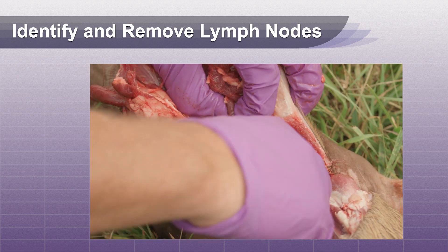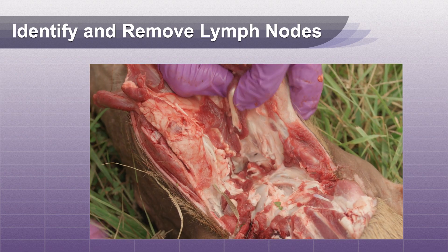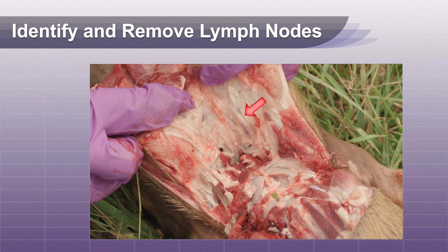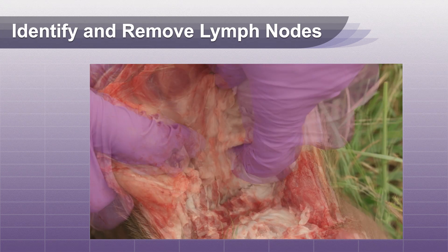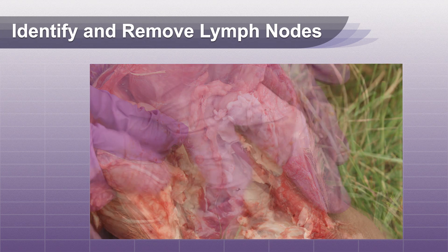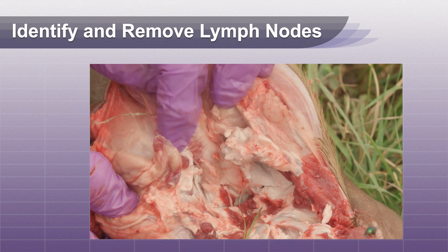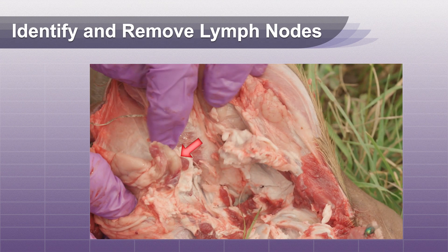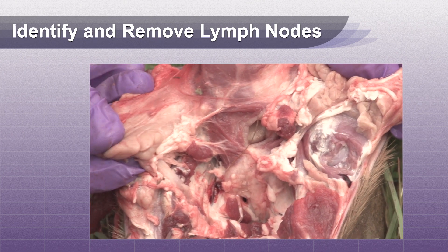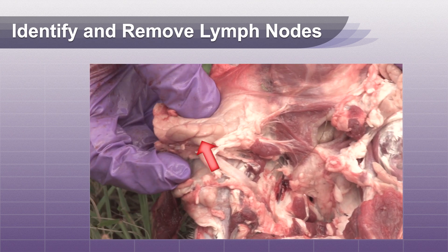It is sometimes necessary to cut away muscle that may be covering the lymph nodes in order to expose them. Remove both the left and right lymph nodes. Lymph nodes should be firm and smooth. Don't confuse them with salivary glands, which are softer and look like a collection of lobes.